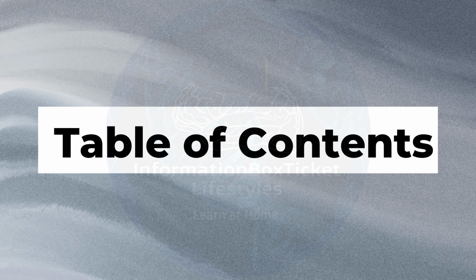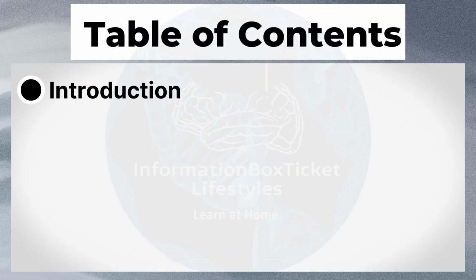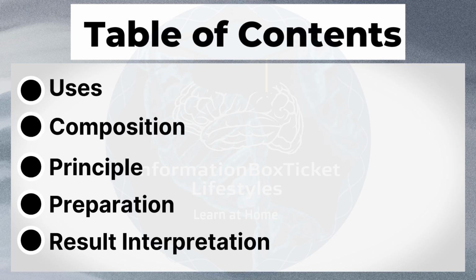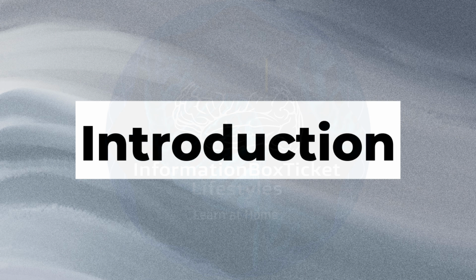Table of Contents. Introduction to Selenite F Broth. Composition. Principle. Preparation. Result interpretation. Uses. Limitations. Introduction to Selenite F Broth.